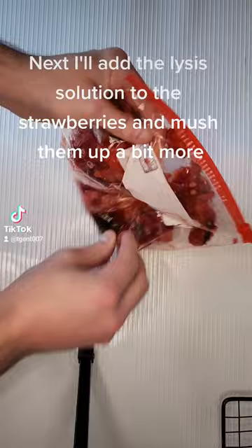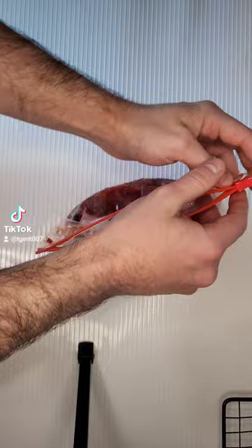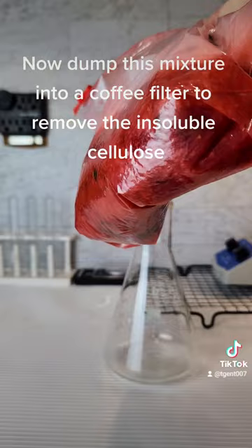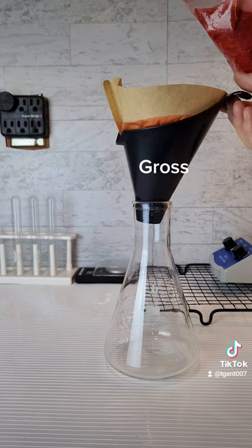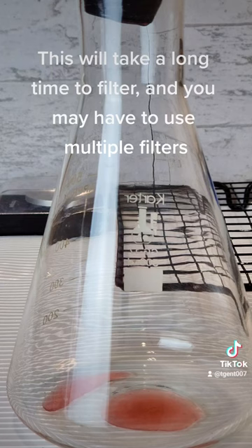Next, I'll add the lysis solution to the strawberries and mush them up a bit more. Now dump this mixture into a coffee filter to remove the insoluble cellulose. This will take a long time to filter and you may have to use multiple filters.